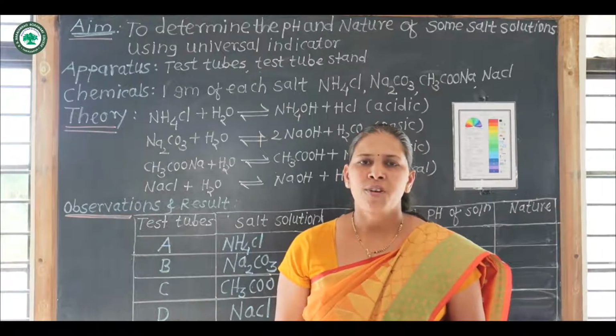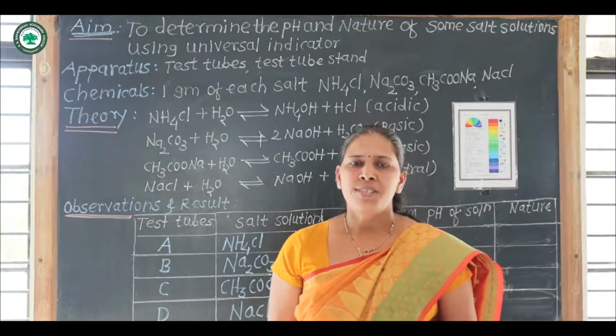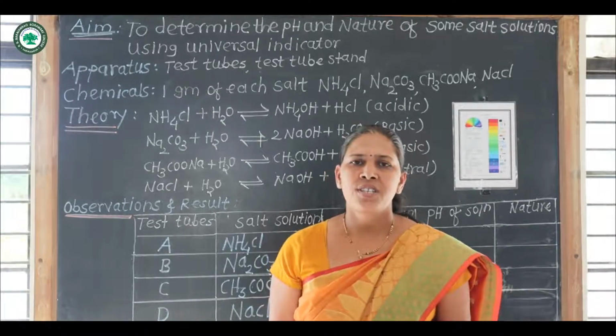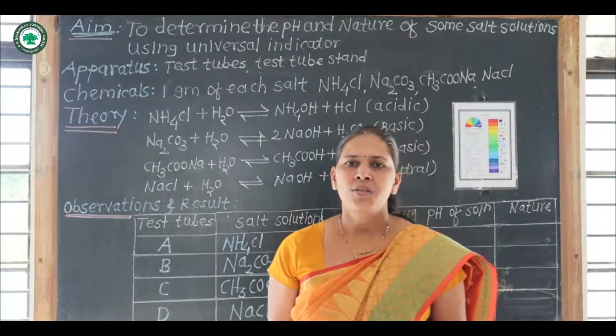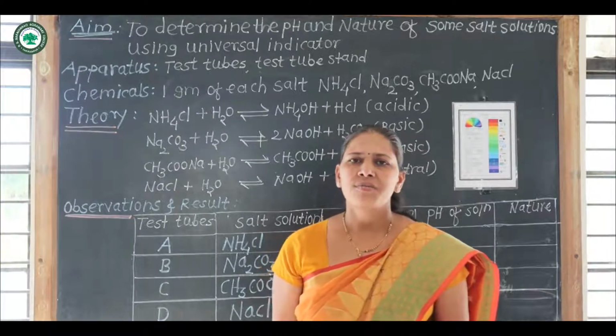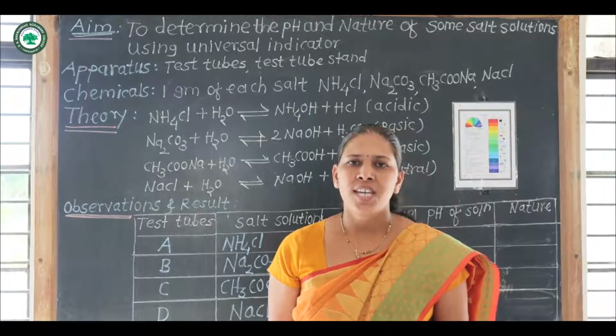Today, we are going to perform an experiment based on pH. We know what is meant by pH. pH is the negative log to the base 10 of the molar concentration of H plus ions. Then we are also familiar with the pH scale.